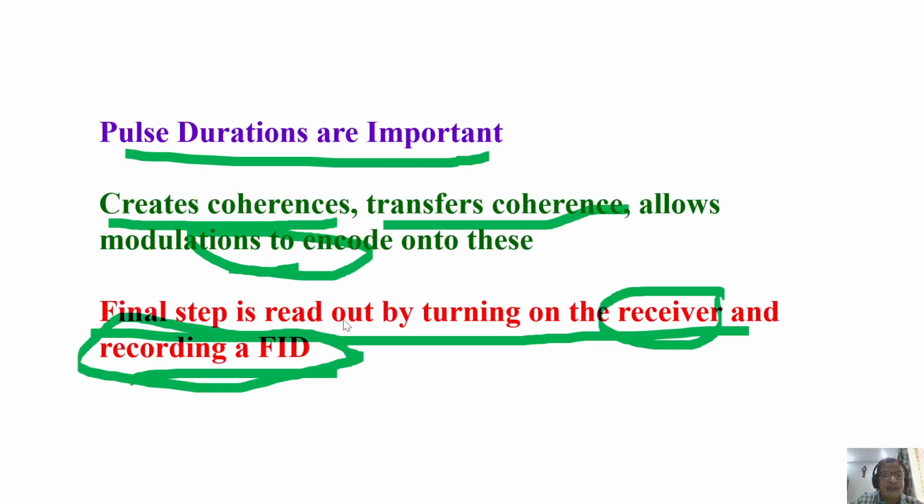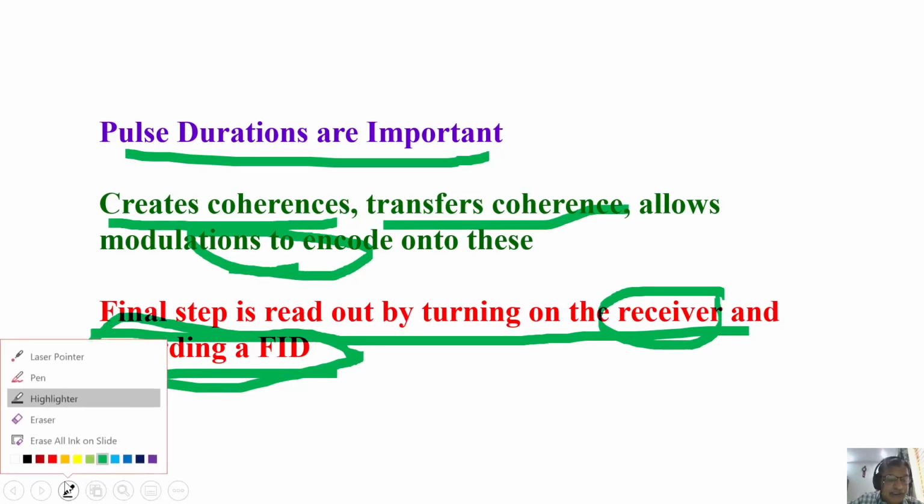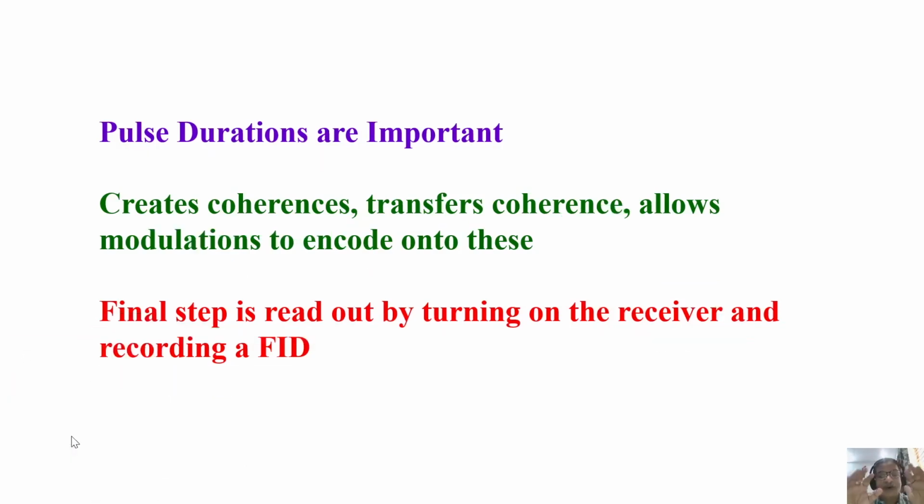You understand what I am trying to say? So designing of the pulse sequence requires a little bit of understanding of the spin dynamics, so that we know what is happening to the magnetization during the application of different pulses of different widths and different nuclei, with different delays, and how they are evolving. If you understand that, you know what the final outcome is.